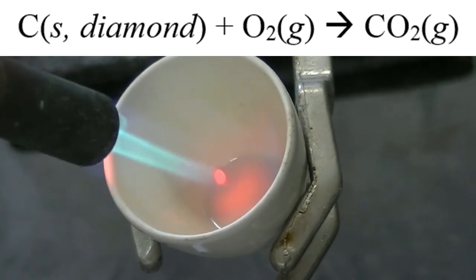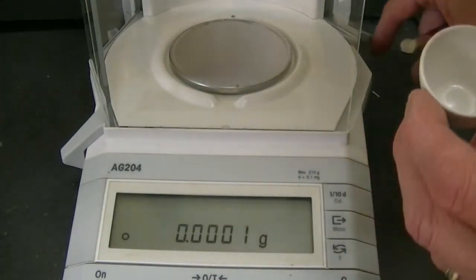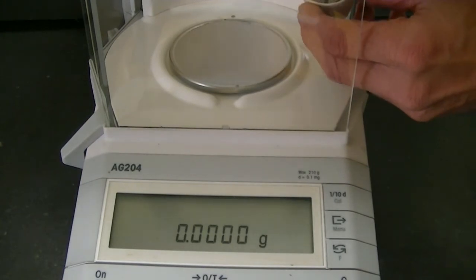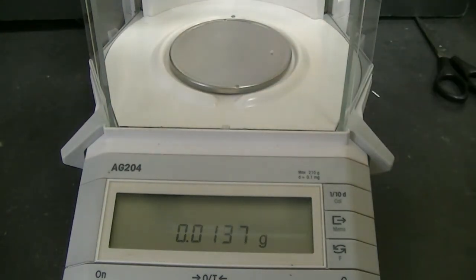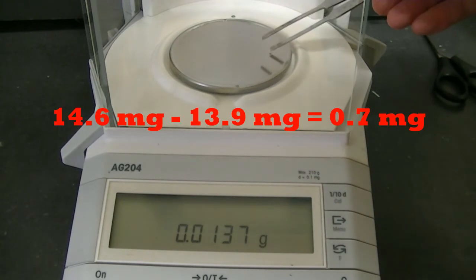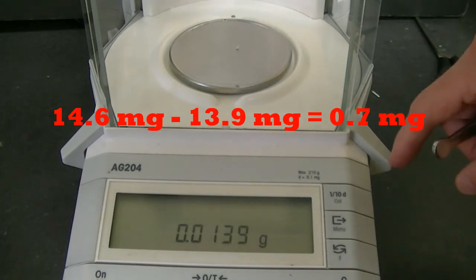Altogether, I spent about 10 minutes heating the diamond. Now that the diamond and crucible have cooled, we'll weigh the diamond to find out how much was converted to carbon dioxide. Remember, the diamond started at 14.6 milligrams. And it looks like it's lost some mass — we're below 14 milligrams, looks like about 13.9 milligrams. So 0.7 milligrams of the diamond has been converted to carbon dioxide.